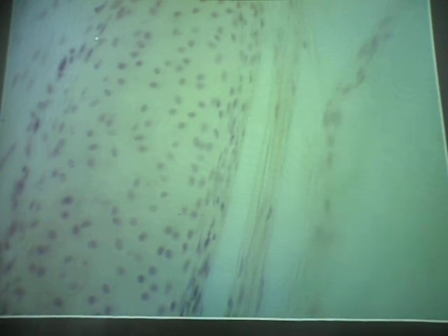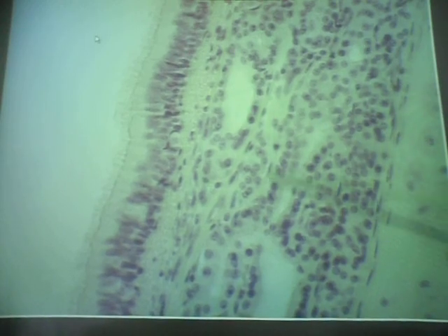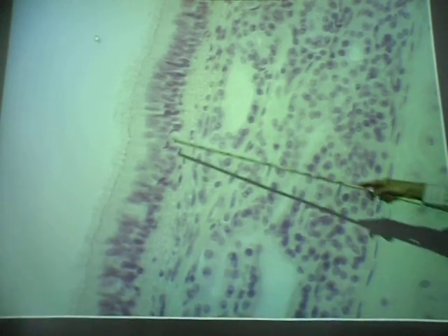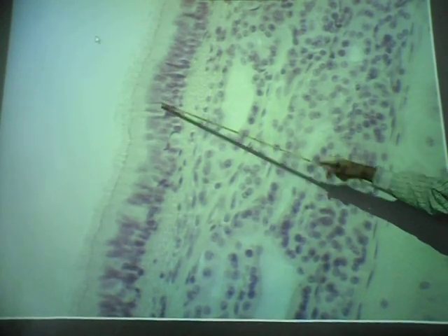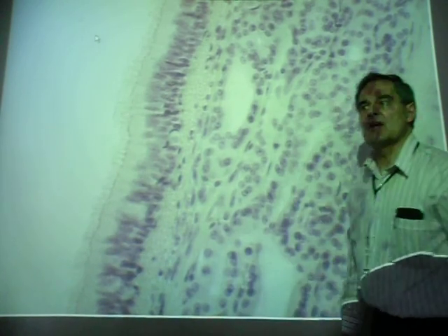And then you may also be able to see out here smooth muscle, part of the trachealis muscle. And it may be a little confusing at first because the trachea is often kind of collapsed around itself, so it'll be kind of folded back or doubled on itself as well. Okay. So the smooth muscle, the hyaline cartilage, and in the connective tissue, be able to pick out these seromucous glands, which we see in here. They're multicellular. And then the goblet cells, okay, and then the cilia, and of course the epithelium itself, is pseudostratified ciliated columnar epithelium.